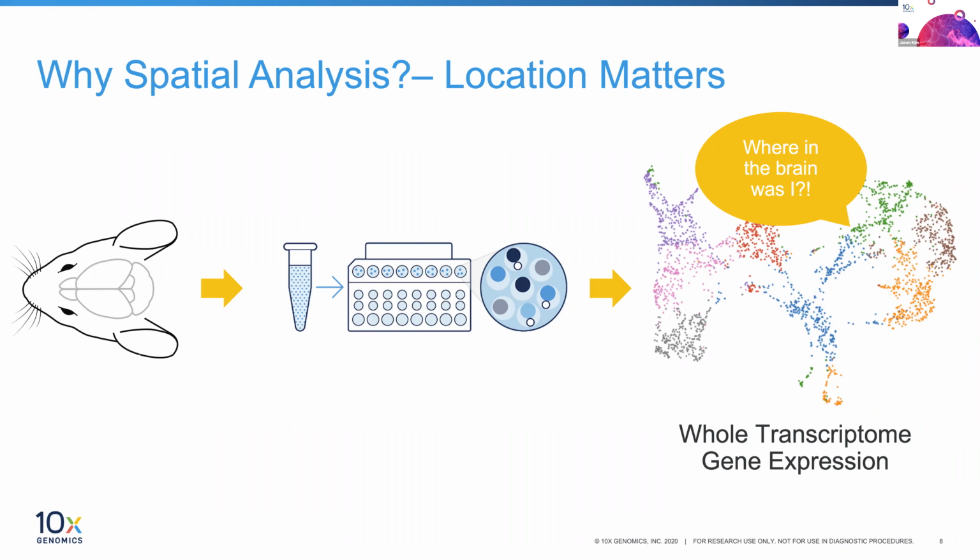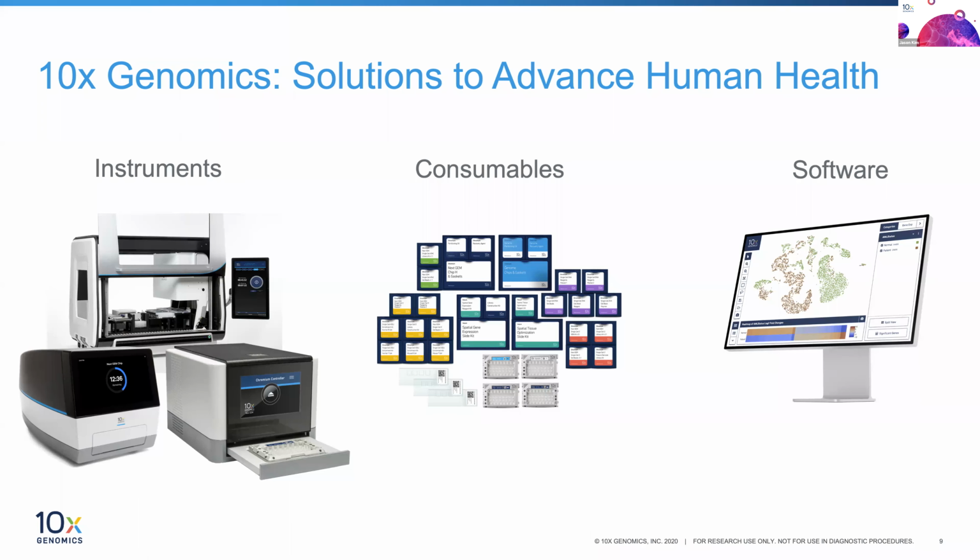Spatially, you could imagine having two different samples of the same tumor, let's say, with nearly identical single cell types, right? So let's say you dissociate both these tumors from two different patients, and you do a cataloging of the cell types that are there and the abundance they're found in. You'll see probably the same cell types and cell numbers in general between the two tumors, but without that spatial context, you wouldn't know that maybe one of these tumors had most of its tumor infiltrating lymphocytes, for example, at the periphery of the tumor, while the other had them located within. And that could have key differences or impacts to how downstream therapies or other interventions could play out. And so that just highlights how important having that spatial information is.